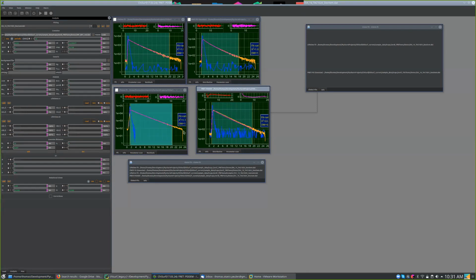Because a low FRET decay will look like a rise term, and then it looks more like a bump in the data. This is how a low FRET decay would look, so that we cannot fit, maybe because there is in fact some additional distance. I don't know.